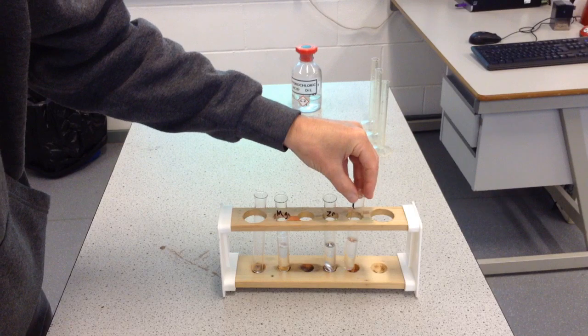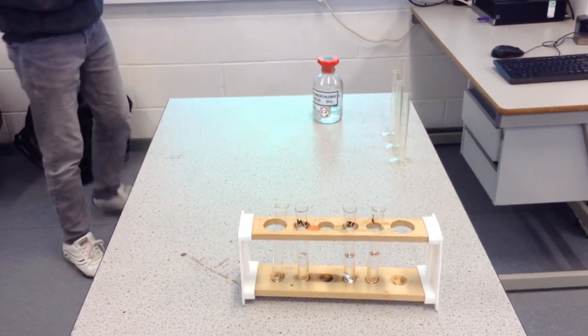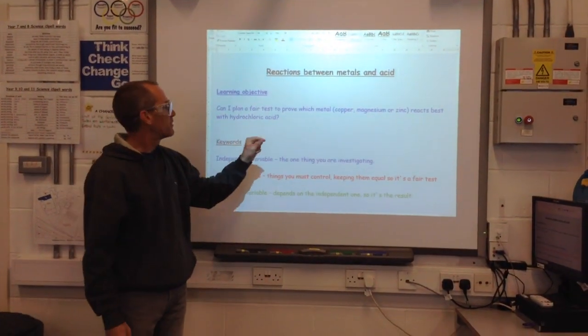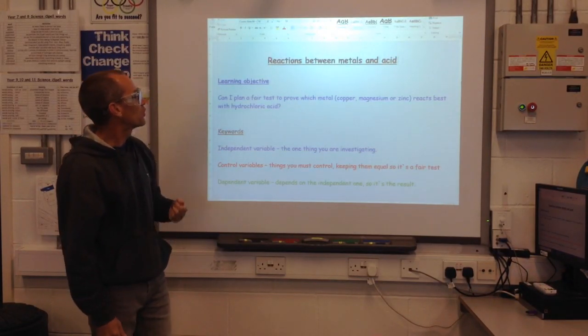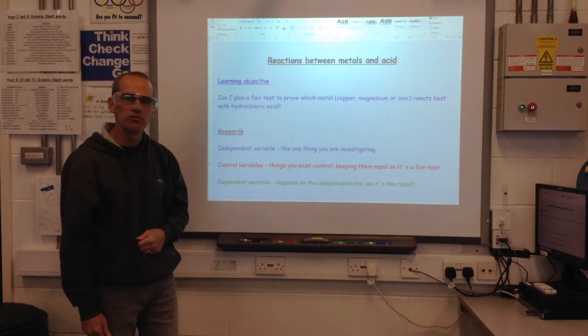So, in a moment I'll be setting you some tasks to go with this film clip, okay? Remembering that what we're trying to do is, were you able to plan a fair test, and are you able to now look at those three results and decide which of those metals has reacted the best and which one has reacted the least with hydrochloric acid?